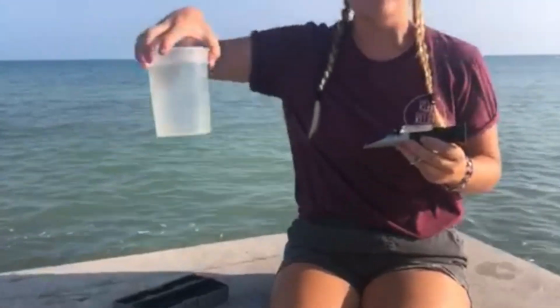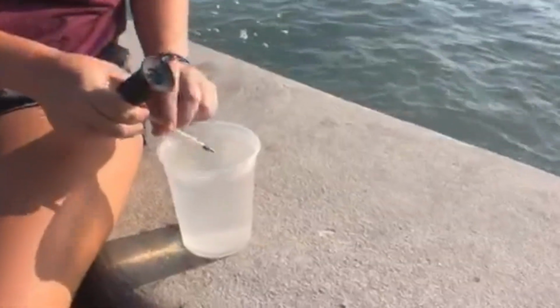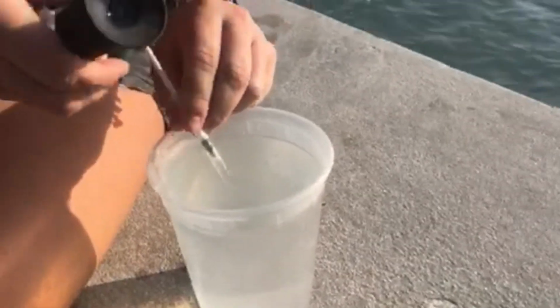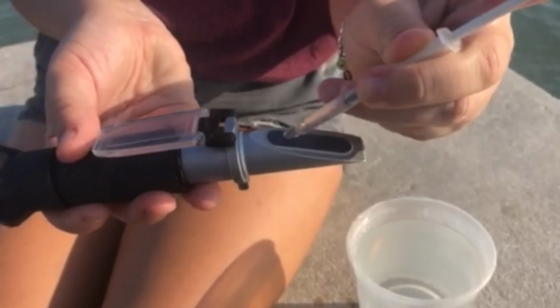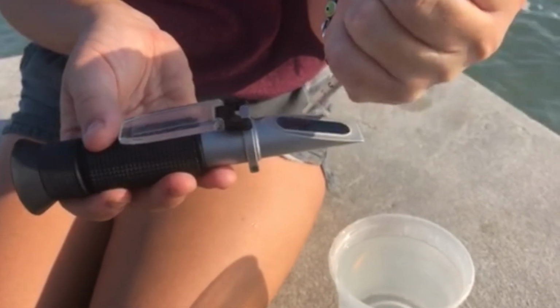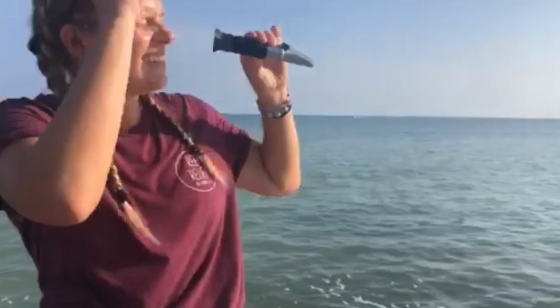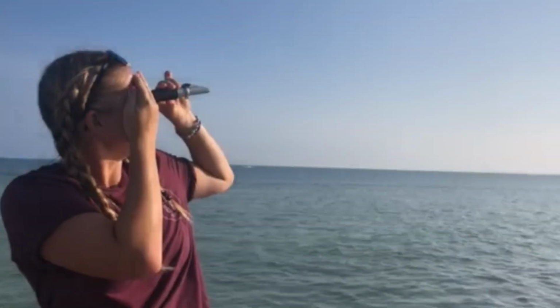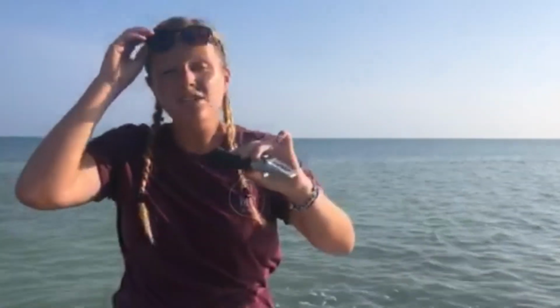So with the refractometer, I took a sample of the ocean water right here. We're going to fill this up just a little bit, and we're going to place it right on this little glass area right here. You just need a few drops. You push the flap over and you look up into the sunlight to see. So it's actually a little bit different from 2 weeks ago.